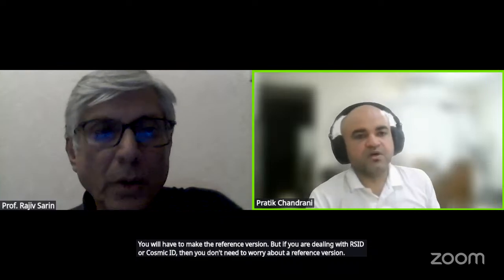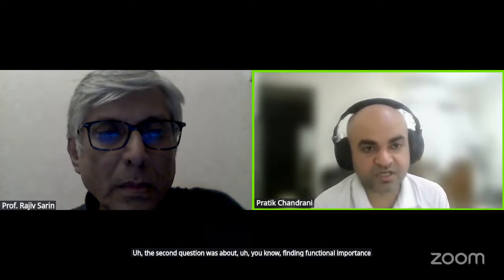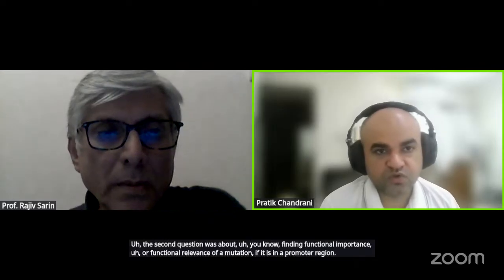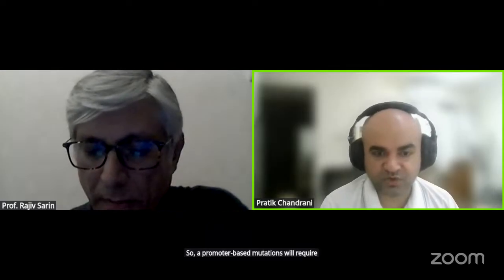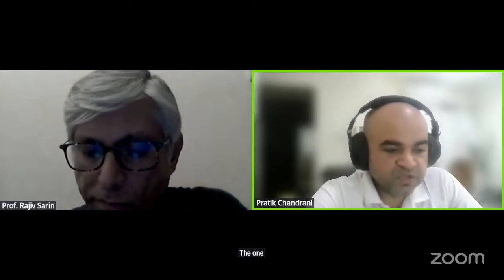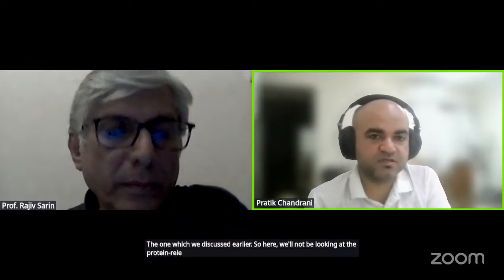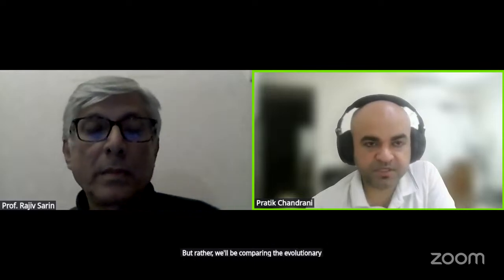The second question was about finding the functional relevance of a mutation in a promoter region. Promoter-based mutations require a different kind of functional annotation tool, and fortunately, they are also present in the dbNSFP database, the one which we discussed earlier. Here we will not be looking at protein-relevant values, but rather comparing the evolutionary parameters of a variant.